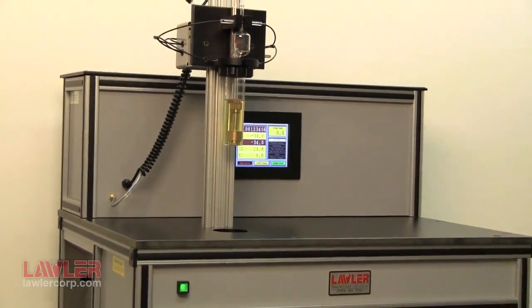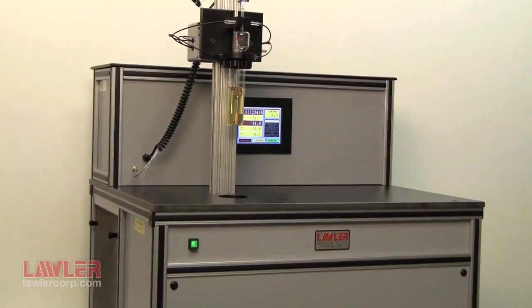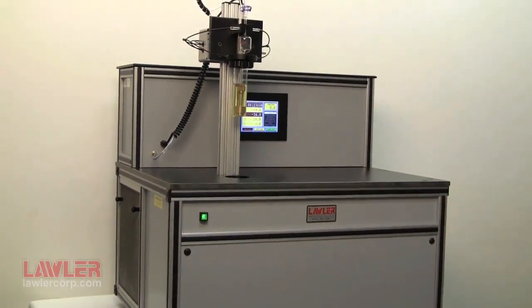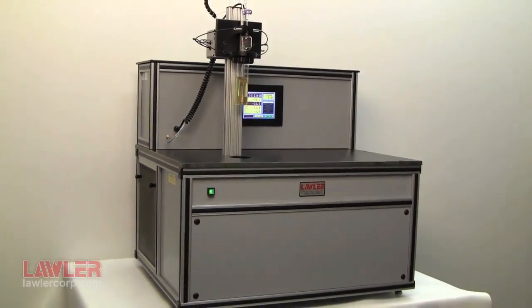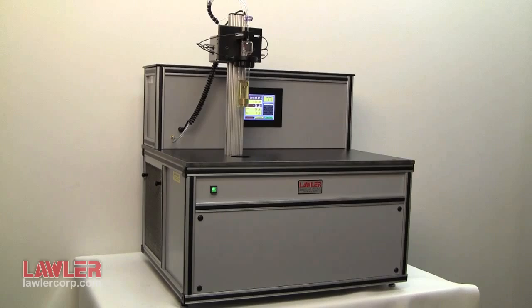Lawler units automate the manual method and so use the same sample volume, glassware, accessories, and procedures. Therefore proper operation can be verified visually.